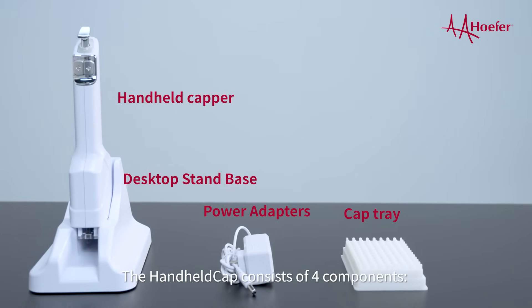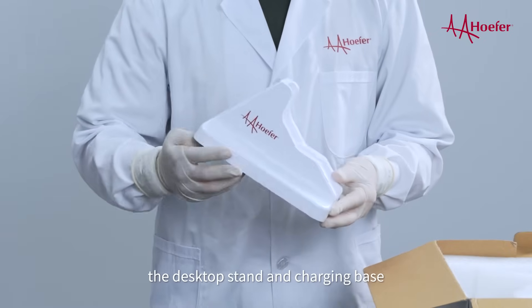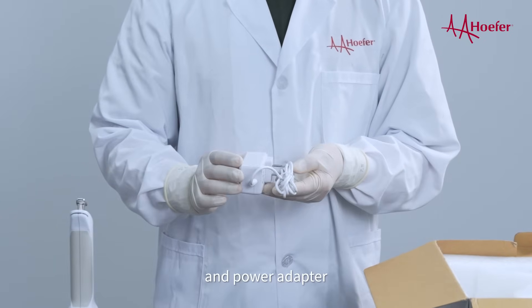The handheld cap consists of four components: the capper, decapper, the desktop stand and charging base, the cap tray, and power adapter.